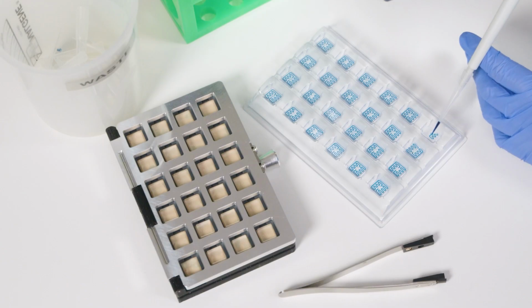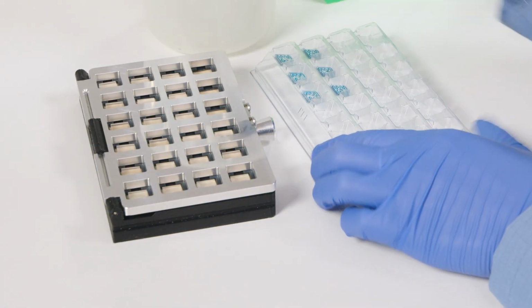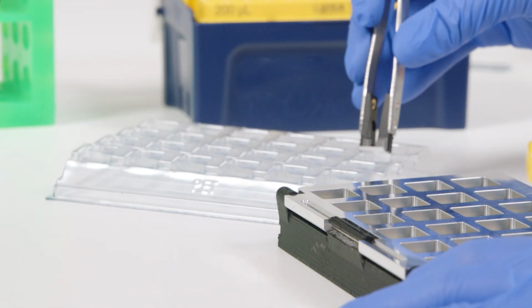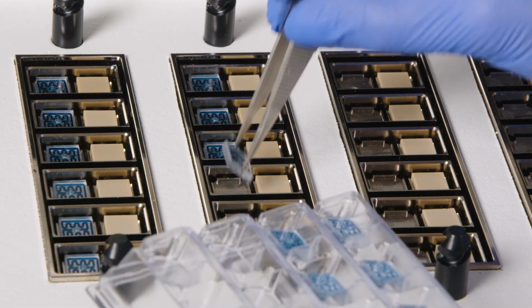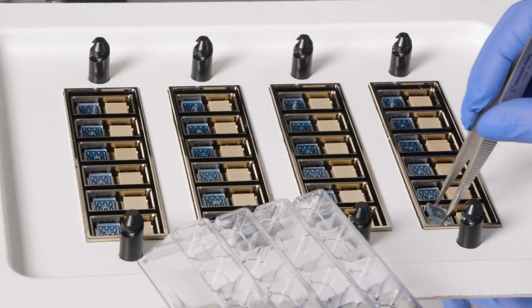Next, to prevent evaporation of the sample, we take an adhesive cover slip from the cover slip release assembly tray and place it on top of the microfluidic chip and gently press. Next, you place the sample microfluidic chip into the sample side of the calorimeter. The reference chips are on the right side, and these stay the same every time.